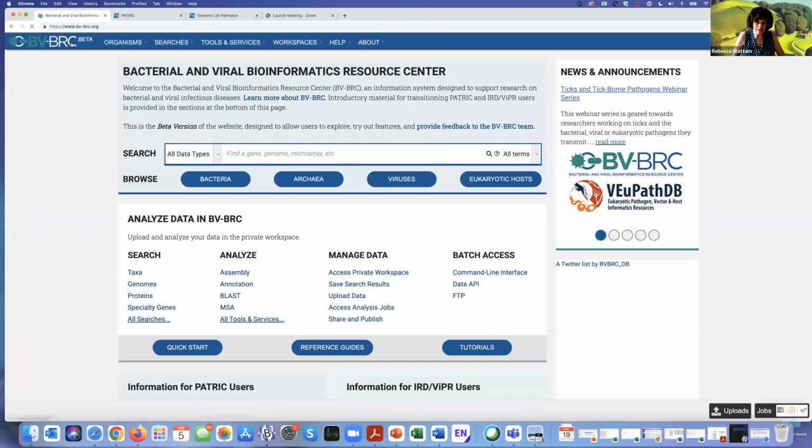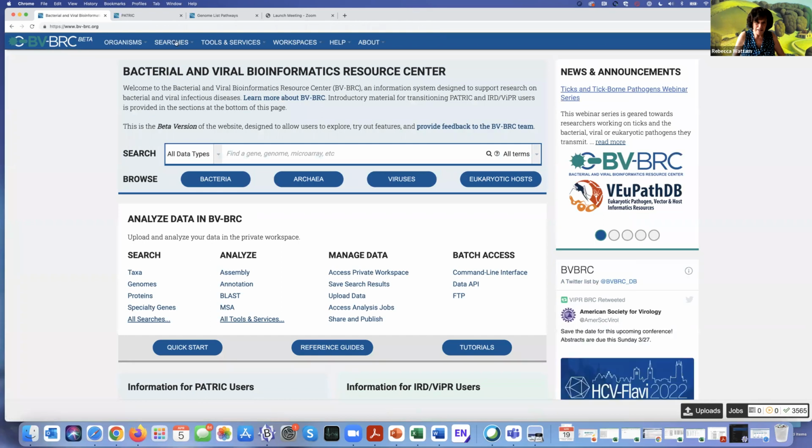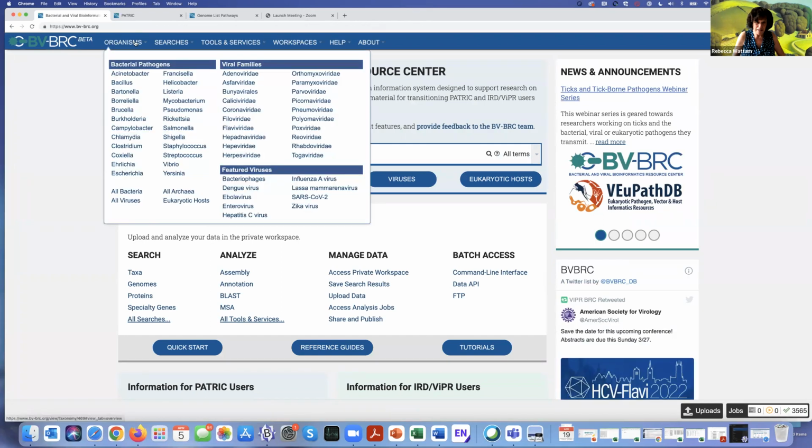So let's go back to the BV-BRC. And let's click on the organisms tab. You can see that when you're looking for data in the BV-BRC, we have bacterial pathogens, we have viral families, we have featured viruses, and then we have some direct links to all bacteria, all archaea, all viruses, and eukaryotic hosts. Now, don't be misled by just seeing these genera for the bacterial pathogens. We have all bacteria in BV-BRC.